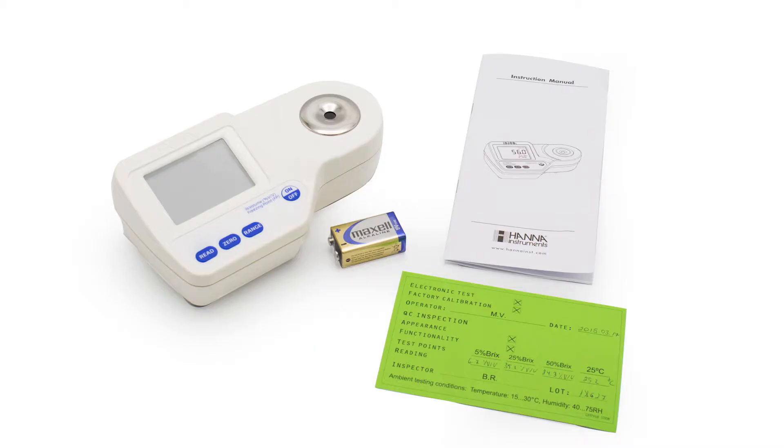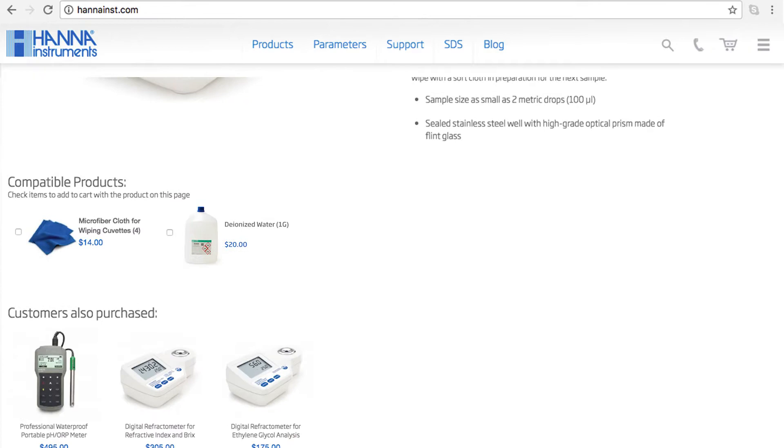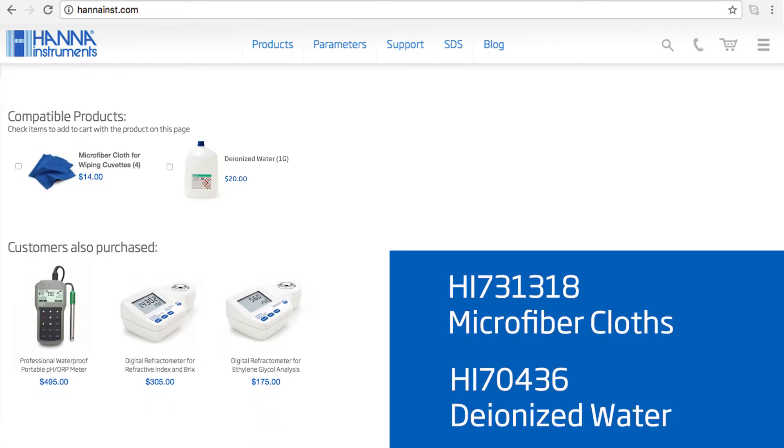Your meter includes one 9-volt battery and the instruction manual. I recommend you check out our compatible products on our website. For this meter, I recommend our HI-731-318 microfiber cloths and HI-70436 deionized water.